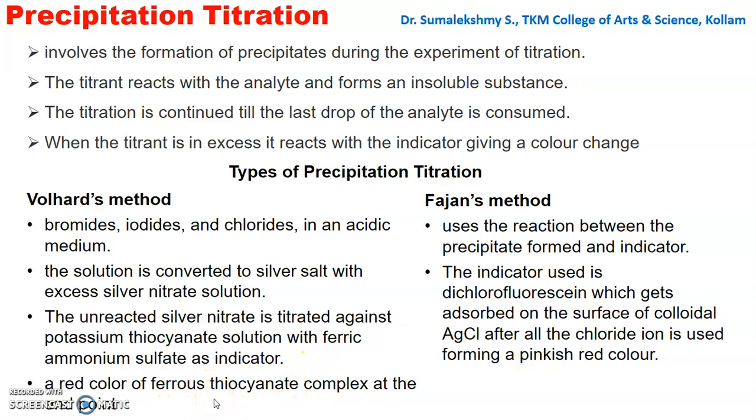So in the reaction, potassium thiocyanate reacts first with the silver nitrate, and once the silver nitrate is completely consumed, it reacts with the ferric salt to form the thiocyanate complex, which is red in color.